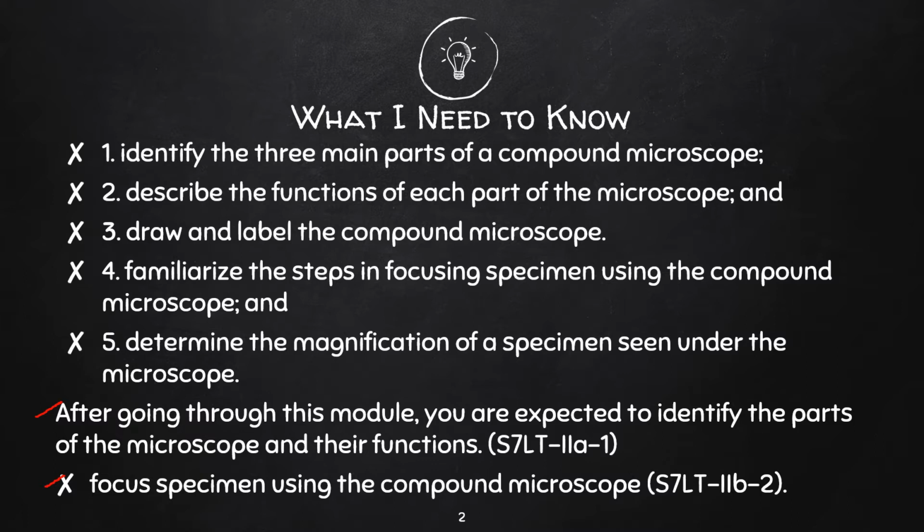Specifically, you would try to identify yung three main parts of a compound microscope, describe the functions of each part of the microscope, draw and label the compound microscope. Yung ikaapat is to familiarize the steps in focusing specimen using the compound microscope, at yung panghuli is to determine the magnification of a specimen seen under the microscope.